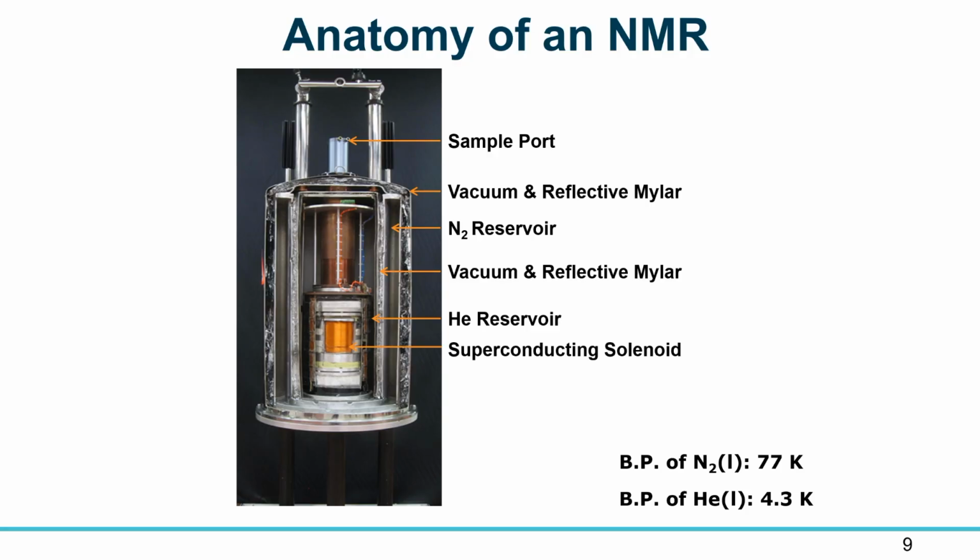The orange-colored solenoid magnet is made of superconducting wire of fine strands of a tin niobium tantalum alloy coated in a copper matrix. Further within the instrument is the probe, which contains receiver coils to detect the signal.